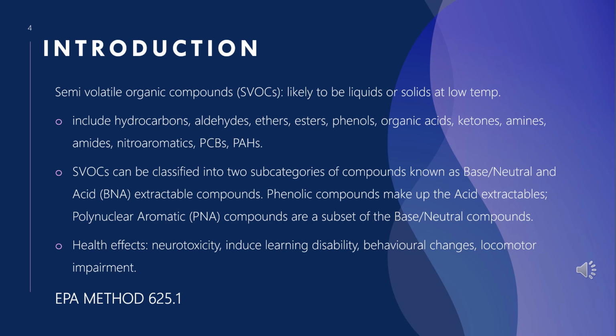In this topic we are discussing the EPA method 625.1, which uses SLE, that is supported liquid extraction, and GCMSMS, which is also known as tandem mass spectroscopy.